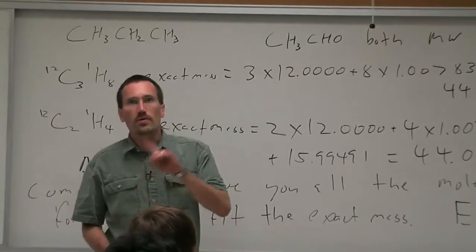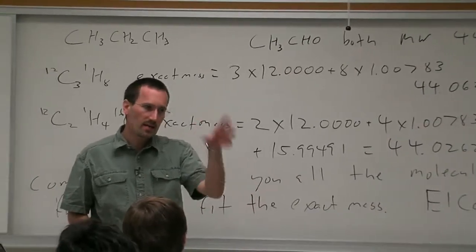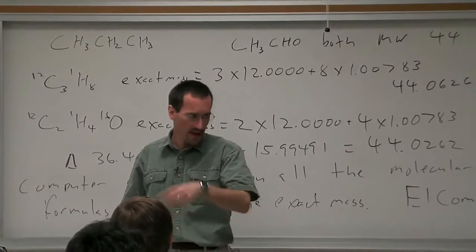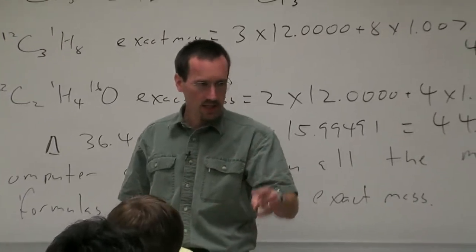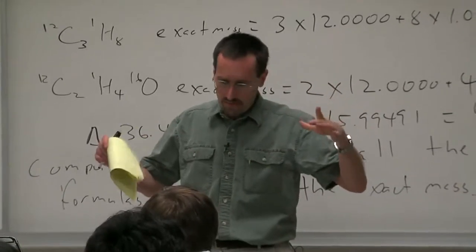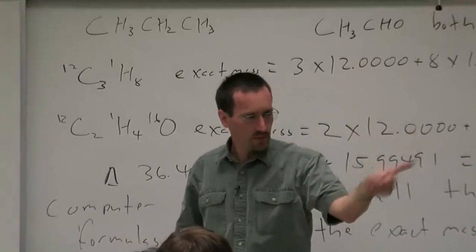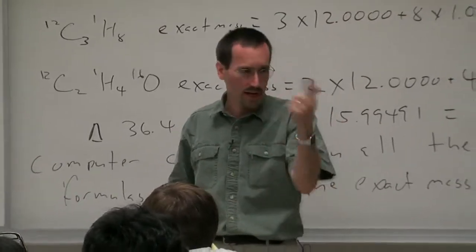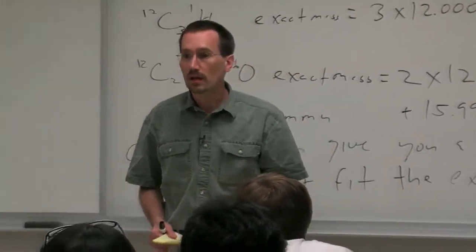So ion cyclotron resonance was a detection method we didn't talk about. An ion trap can be used in mass spec, where you first isolate the ions of a particular mass and then you further collide them or fragment them. But an ICR is a detection technique. What you're doing is basically having a little cyclotron, a magnetic field and a varying frequency, and only ions of a certain frequency will circulate in resonance. And so you tune your resonance and you basically say, okay, because we're right on resonance, we're getting the ion of this mass. Was that in Indiana?